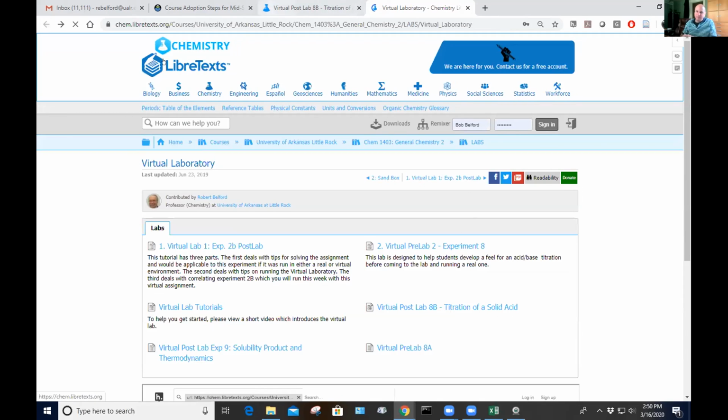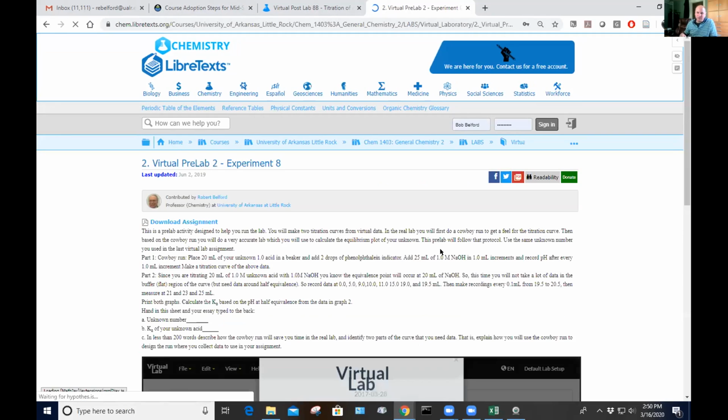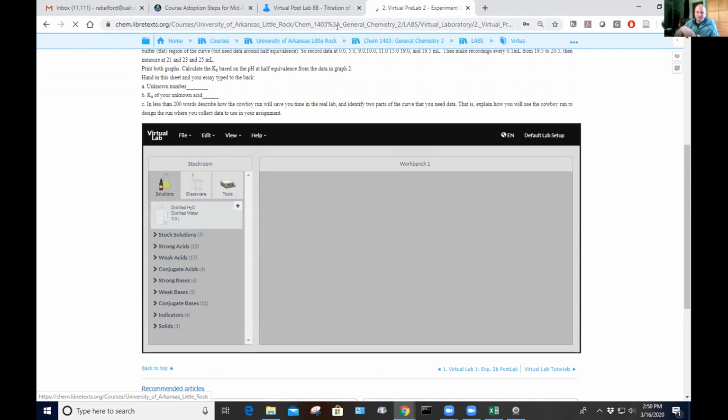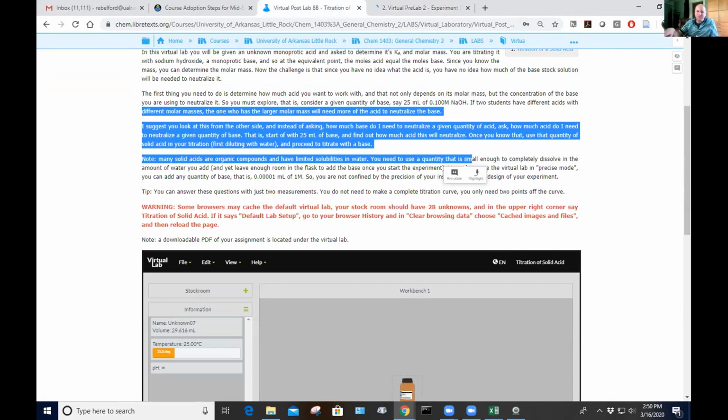That means people are free to write their own side documents, the same as if you were going to write some sort of supporting document for an actual physical lab, where you might give them a procedure. Like when Sandy put the virtual labs into Chem 1, she chose to provide a lot more support in terms of the procedure and have them do one step and input their answer, and we check that, and then the next input we check that. So that's another thing that might be good for people to share.